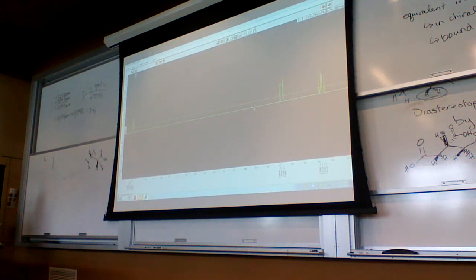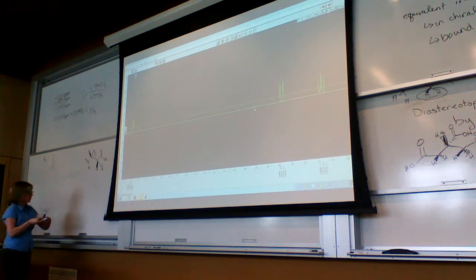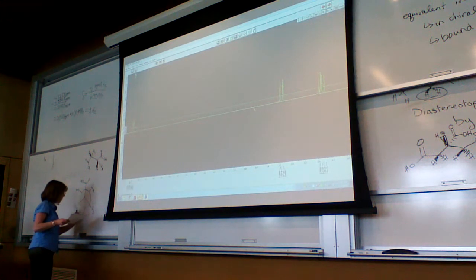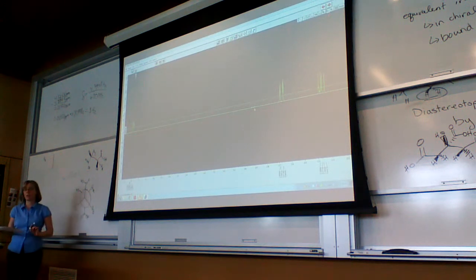How do you know it's A to C? I am almost 100% confident. I can't say for sure that this doesn't rotate into another conformation, but I believe this would be the low energy conformation. Have the 2 carboxylic acids opposite each other.